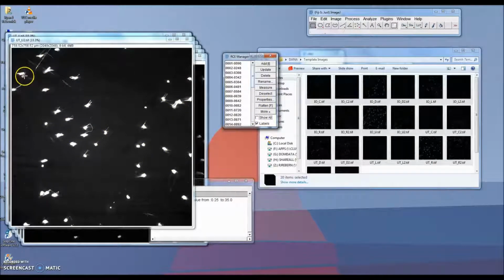There's clearly 2 cells, and it looks okay. As a general rule of thumb, if I find more than 7 multiples in a given image, I discard it. To discard an image, I didn't really mean that you're going to delete the image. I more so meant that you're going to delete the output produced by Dana Part 1.